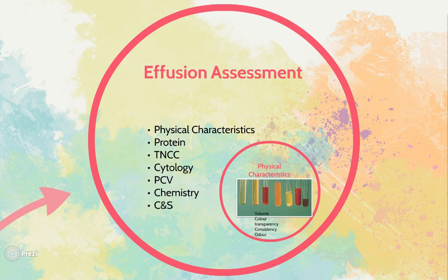So moving on, we're going to get into effusion assessment, and we're assessing the fluid that we've removed based on these physical characteristics: protein, total nucleated cell count, cytology, PCV, chemistry, and then of course culture and sensitivity if it's required.